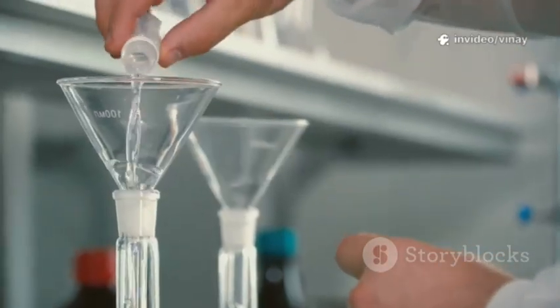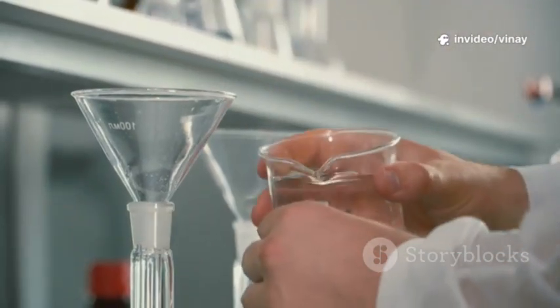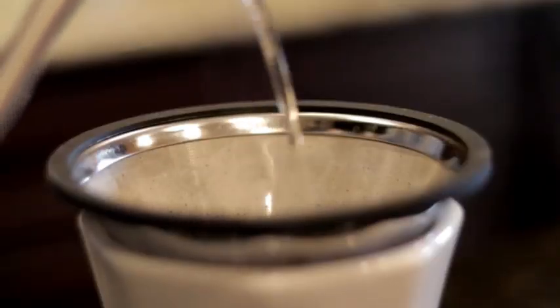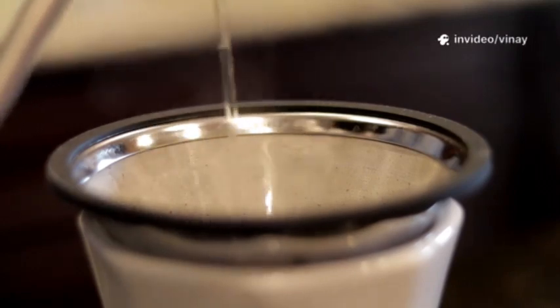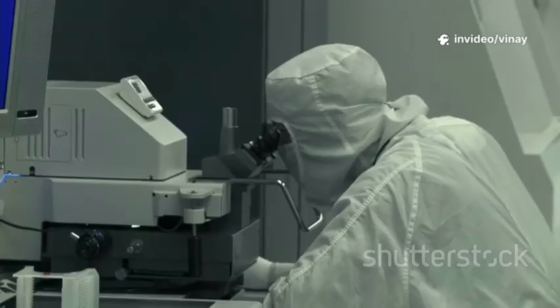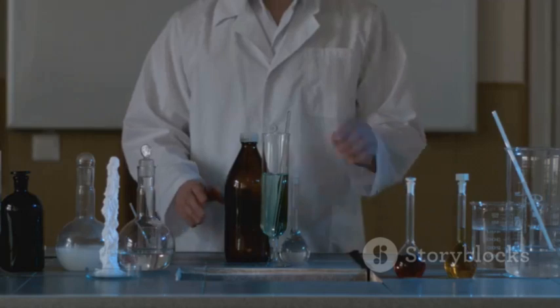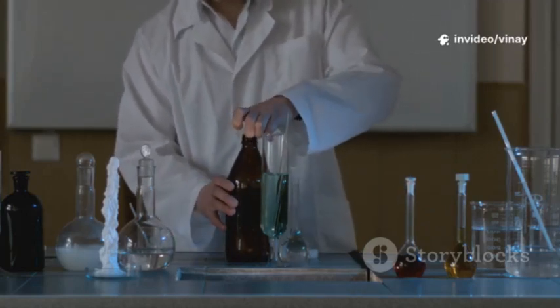Imagine you're making a special drink, like a medicine that needs to be perfectly clean. You wouldn't want any tiny, unwanted things like germs or dust getting into it, right? To stop those things, scientists and engineers use special filters. These filters are like superfine kitchen strainers, but on a microscopic level. They are designed to catch incredibly small particles, especially bacteria, to make sure the medicine is safe to use. Filter integrity testing is our way of checking to make sure these filters are working perfectly.